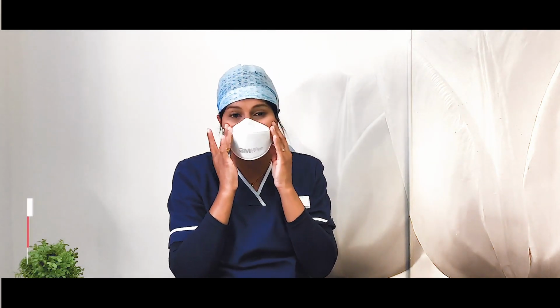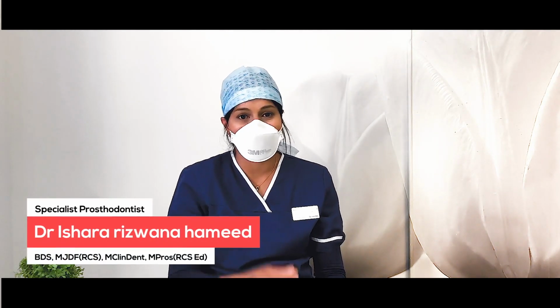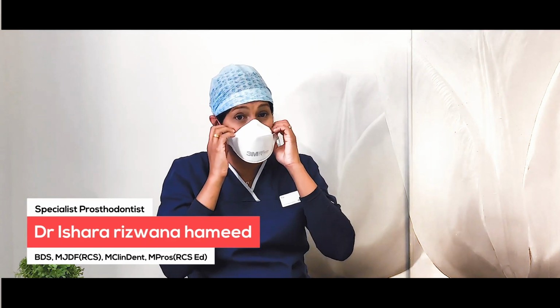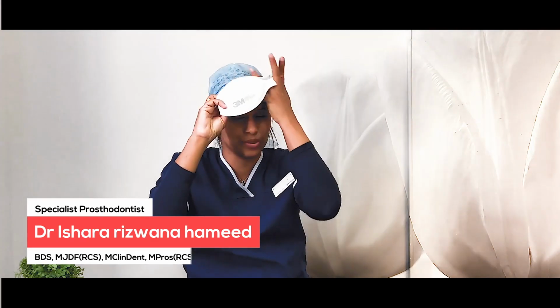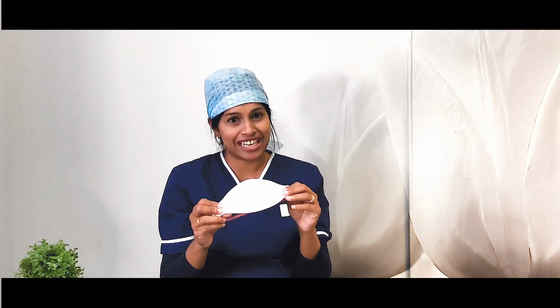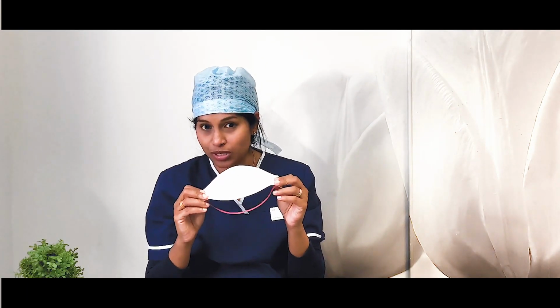The seal is very good, and almost everybody I know has fit tested for these, but the only problem is that it is in shortage, and it is only available to the hospital premises. So this is the 3M FFP3 disposable foldable type.